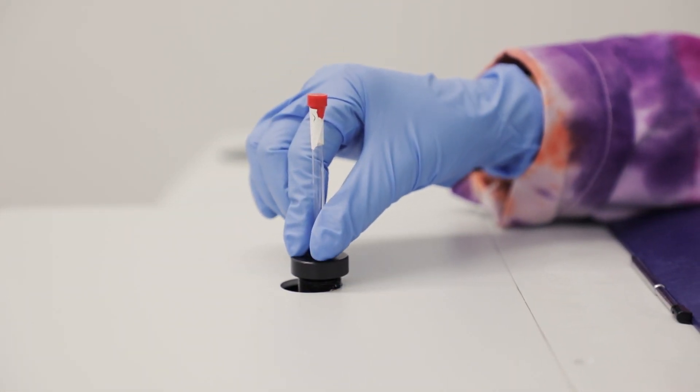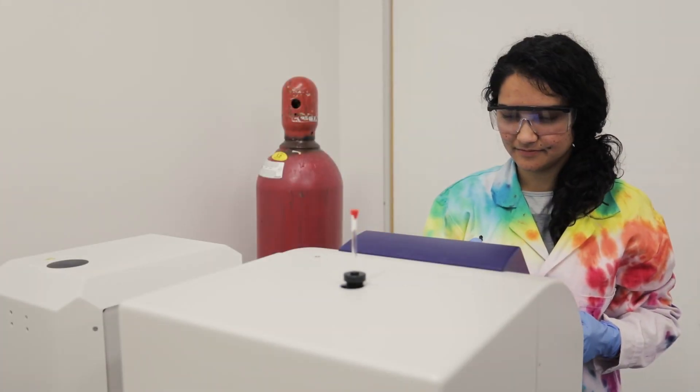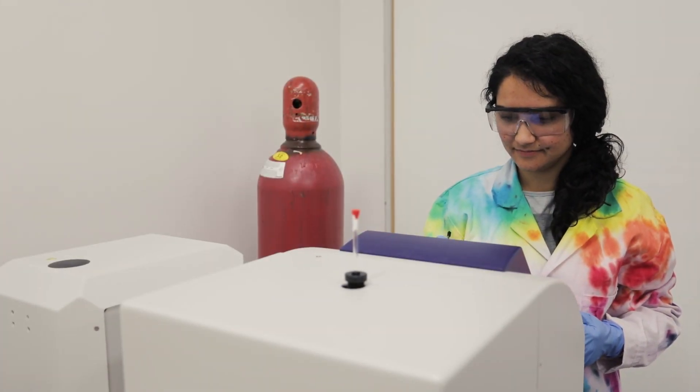And these compounds cannot be looked at by using NMR but the Electron Paramagnetic Resonance is complementary to the NMR technique.